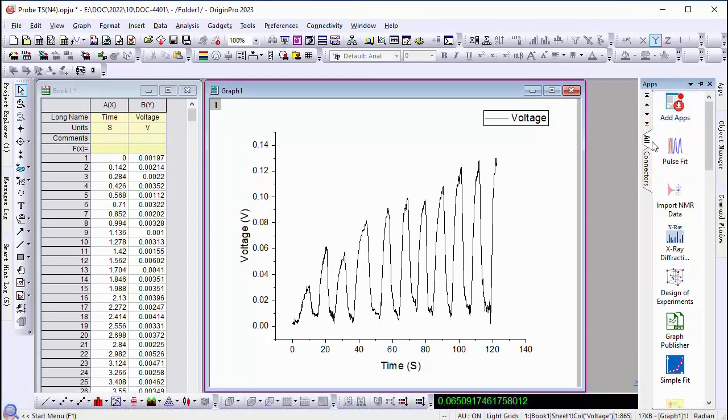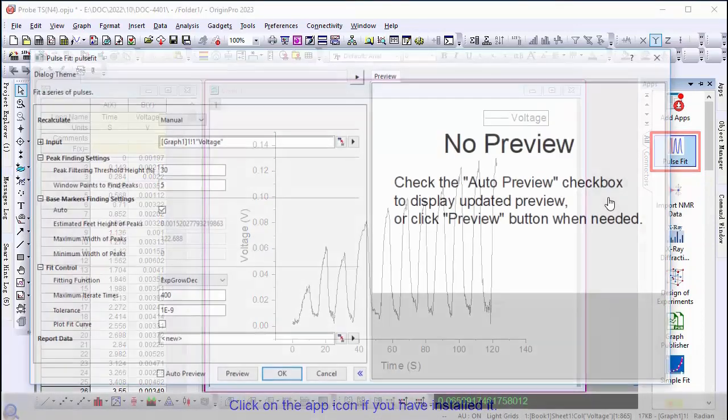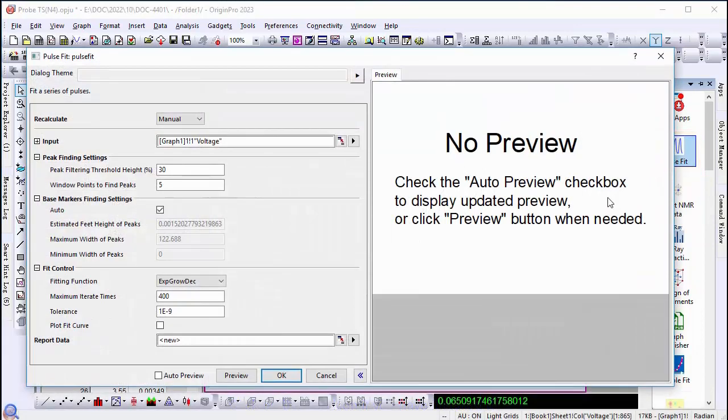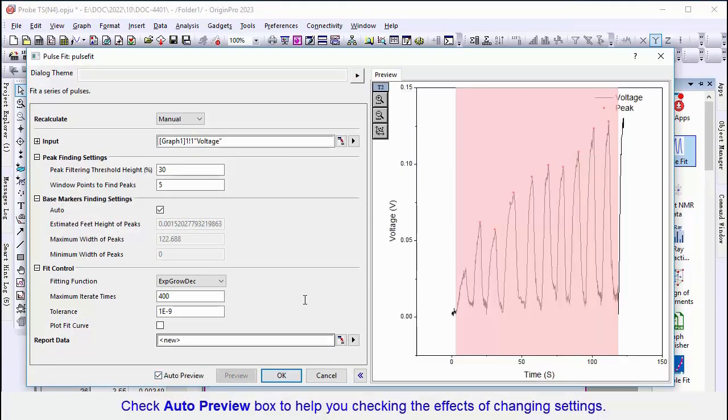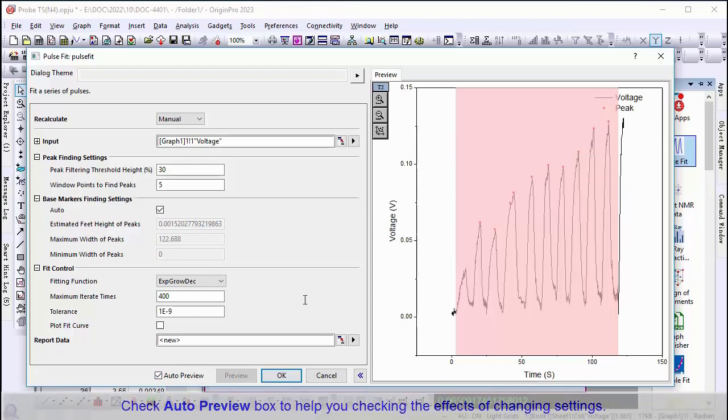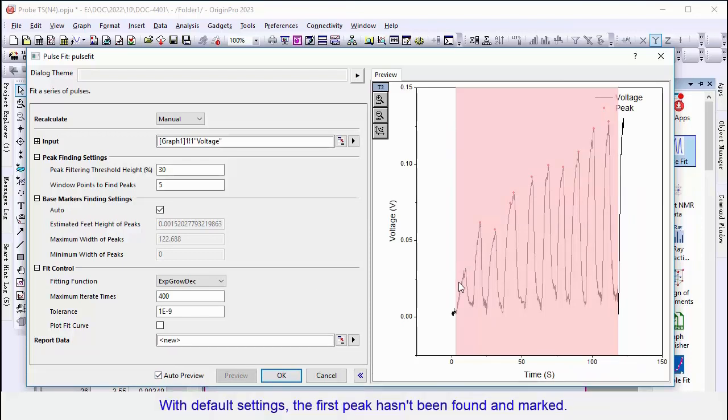Here we are going to fit this data which has a series of pulses. Click and open the app. Check Auto Preview. As shown with default settings, the first two peaks haven't been found and marked.